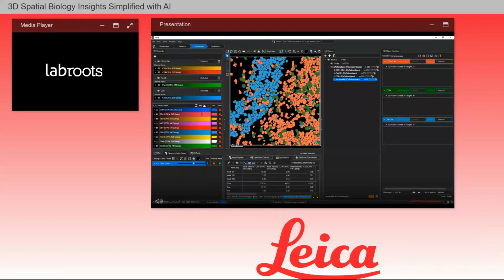The unclassified class are objects that cannot be placed into any of the predefined phenotype classes due to low phenotype confidence. You can examine these objects more closely, and this is a great way to do a quick quality check on your classifier. You can examine the unclassified objects closely and either update your training to incorporate these cells or remove them from your analysis.